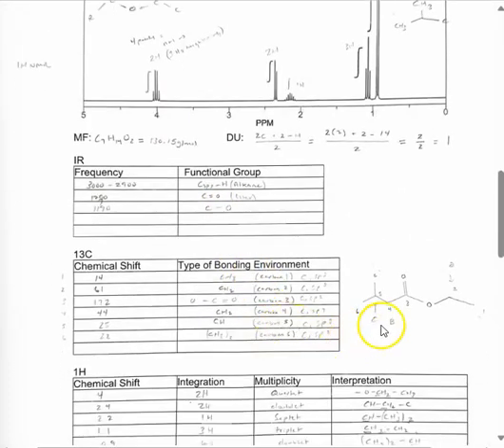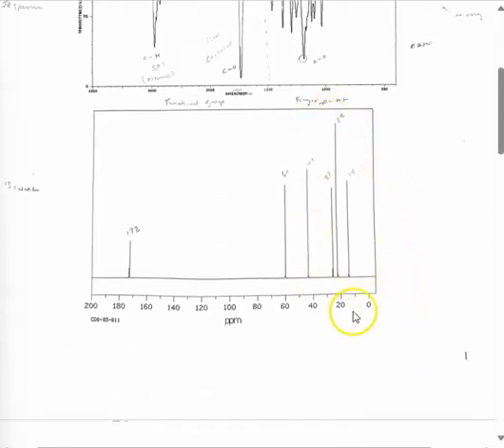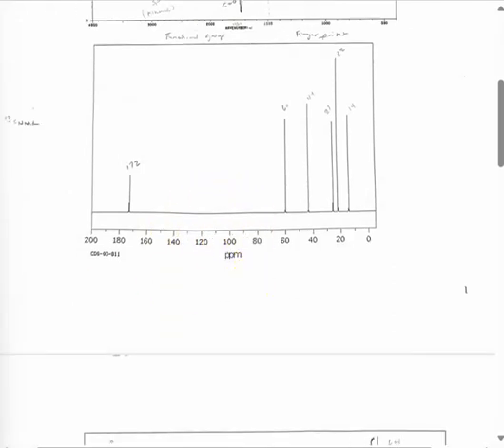Carbon 4, or the CH2 group, is at about 44. Carbon 5 is at about 25, and carbon 6, or those 2 methyl groups that we see here at the end, would be at about the 22 marker up here in this table. And as we mentioned previously, 2 or more carbons that have the same environment can be represented by a single line.